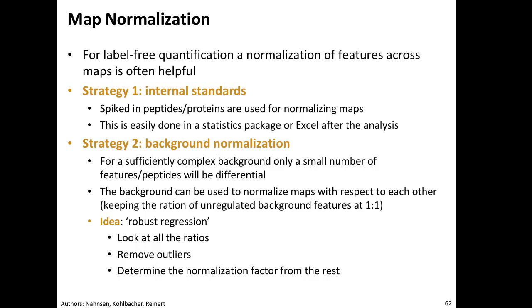We will process some of the OpenMS data also in R, in MS Stats, in other parts of the May Institute. There are different ways to deal with normalization, and that's a big issue in label-free, because you have no internal normalization as you have in SILAC or iTRAQ. There are different ways people have addressed that. One is spike-in peptides or proteins, make sure they are on all maps, and then normalize on that. Doesn't really work all that well.